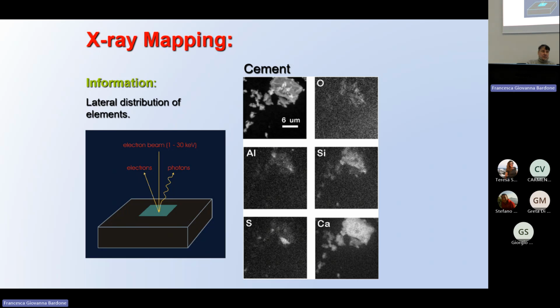People from the minerals industry ask me for fractions of a percent because they want to know exactly how much of these elements are present. Other people coming from other disciplines just want to know, oh, this is calcium, and it's a calcium carbonate, and that's enough, not quantification. You can have different types of software to do all the things you want. The best ones, those which come from the work of Professor Castaing in France, use standards, and with standards you can go down to a fraction of a percent, quantitatively.